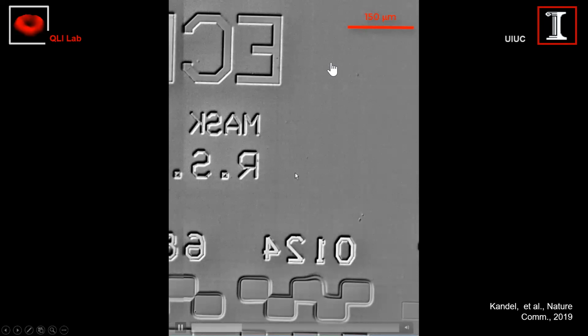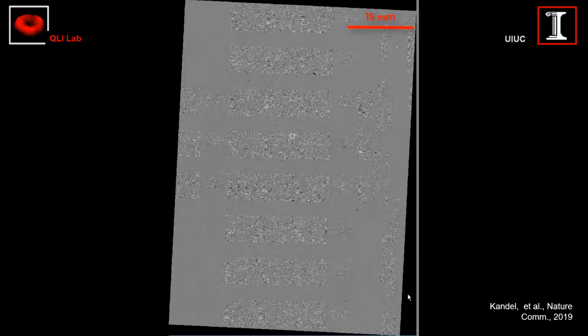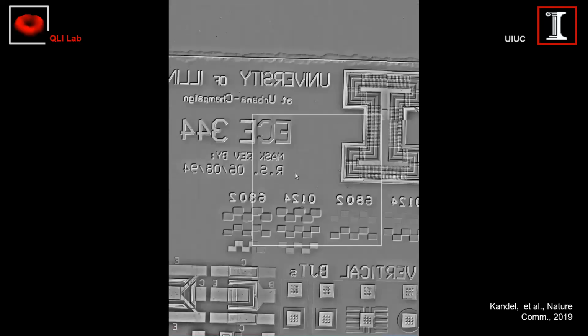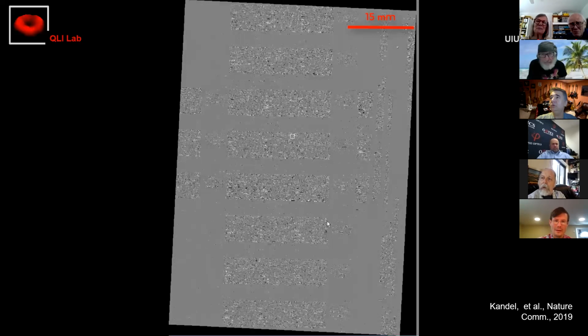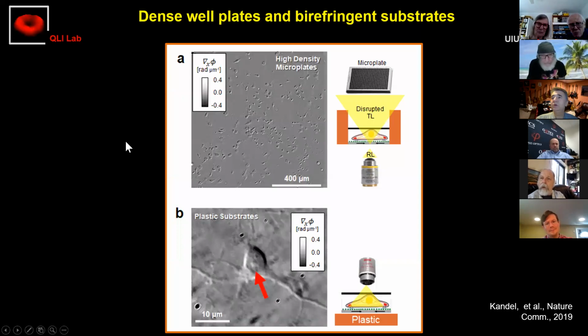And in the process, we claim this is the largest quantitative phase image ever acquired, because it's something really like this big, except it's imaged with some micro resolution in X and Y and nanometer scale topography. So this would probably take 2 years to do with a force microscope, and it took us maybe less than an hour. So anyway, this is an ultimate example for an opaque system.